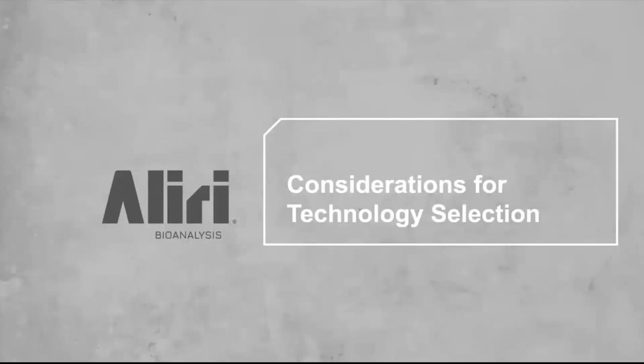So where does that leave us? Well, there are several considerations for technology selection, especially for where you are in the development pipeline. I'm going to let Shane discuss some of these considerations as well as why you would choose LCMS or LBA. Great, thank you for that overview, Matt, of LCMS and LCMS hybrid assays.